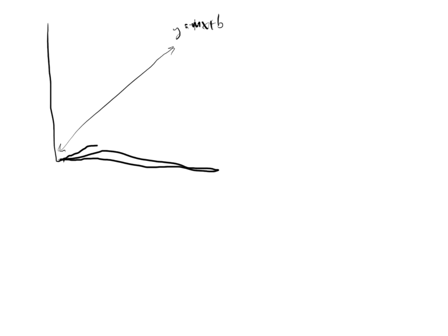The issue here, though, is that that's not the only option for calibration curves that I have. It's going to be very rare, but you could have data that fit a non-linear curve or relationship, and there is a mathematical representation out there for that data. These are things like exponential curves or logarithmic curves. Those sets of data can be seen in a laboratory.